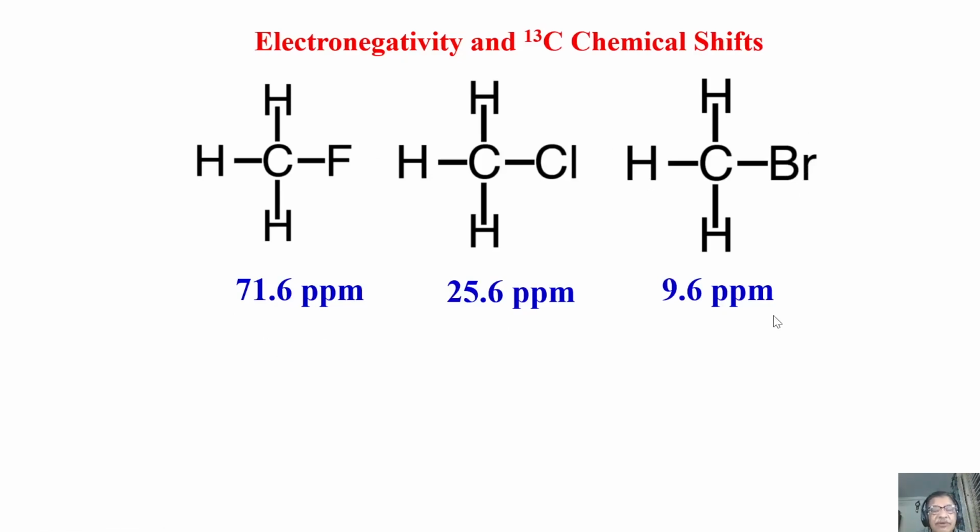What does it tell you? Again, more than electronegativity, it withdraws electrons from the carbon. As a result, that carbon shifts downfield. That's exactly what we observed in proton, right? The logic is the same. The phenomenon is not different.